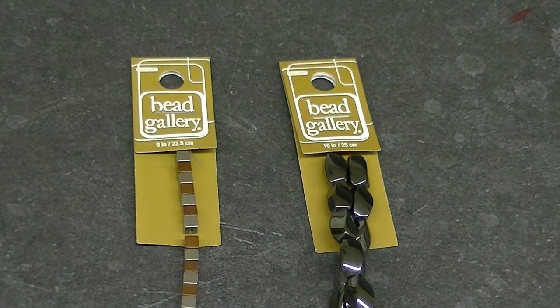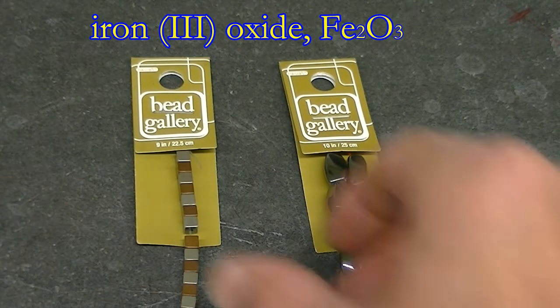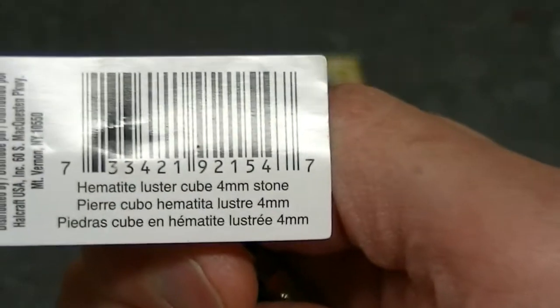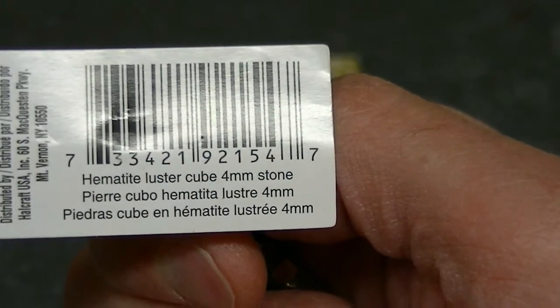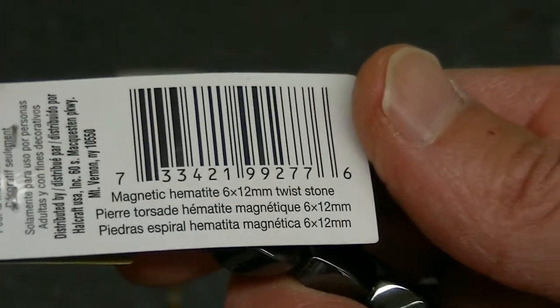We're going to do some various tests on these beads to see if they're made of hematite or not. The chemical name for hematite is iron 3 oxide, and as you'll see, hematite displays some very curious magnetic behavior. These beads are sold as hematite luster stone, and these beads over here are sold as magnetic hematite.